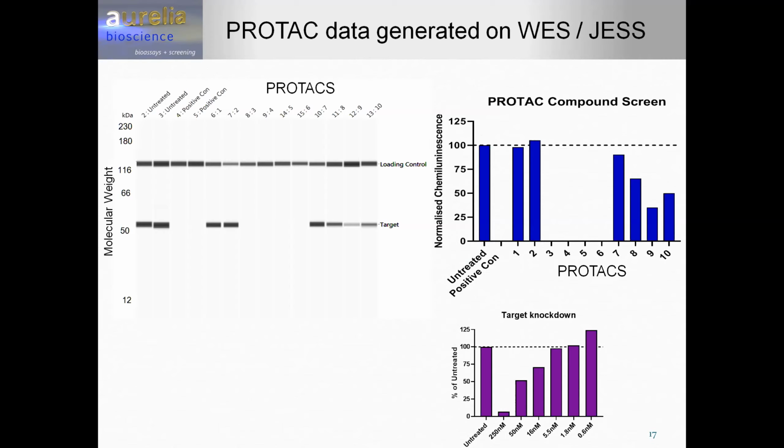And down at the bottom there is a demonstration that you can do a dose response in this technology and get some DC50 numbers.